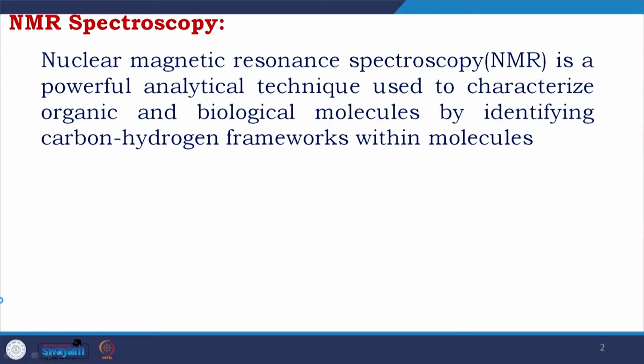To start with, NMR spectroscopy, or nuclear magnetic resonance spectroscopy, is a powerful analytical technique used to characterize organic and biological molecules by identifying the carbon-hydrogen framework within molecules.